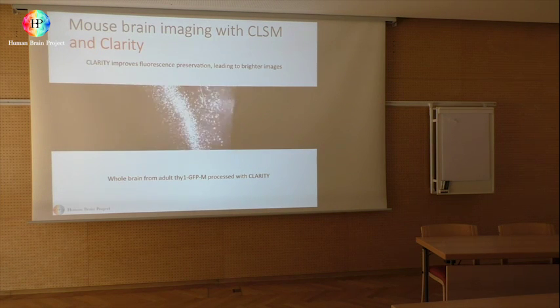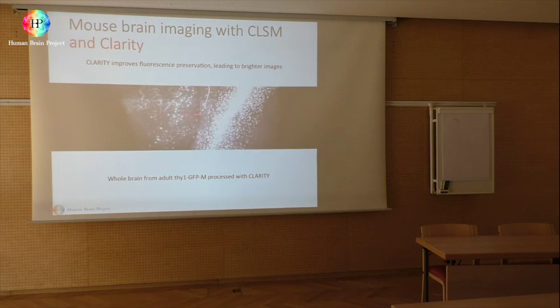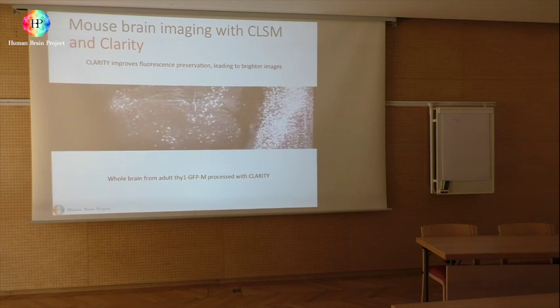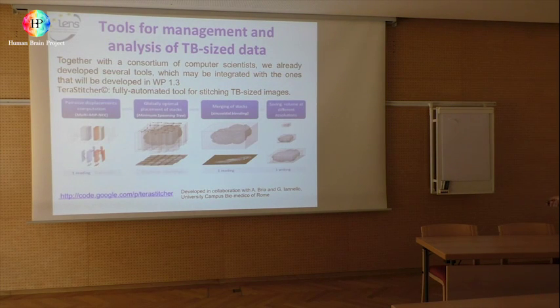And then if you use CLARITY, for example, you see how you can visualize and follow processes all over the brain. Of course, then comes all the processing you were telling before. And that takes another 2 weeks.